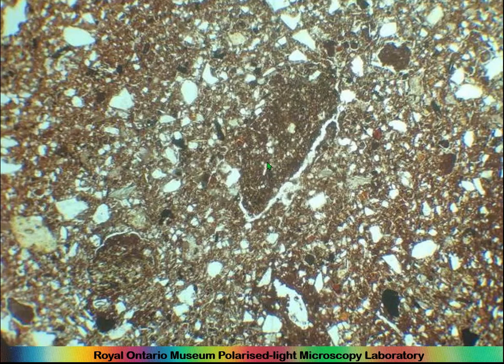And another thing is, if you sit back and look at the whole thing at the same time, you'll notice that certain areas have a lot more inclusions than other areas. And you see there's even a slight color difference between this area over here, this area in the middle, and this area over here. Sometimes the color is due to the firing atmosphere, but in this case, it really looks like this is being badly mixed together of different clay raw materials.